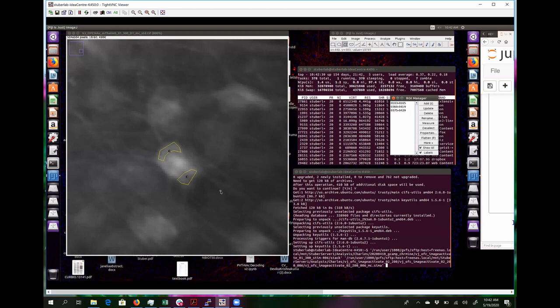ROI2, it's actually pretty clear to me where the cell is, but cell 3, it's hard to see where it is. There's some element of getting used to this. I've looked at this so many times, and not just looking at this, but comparing it to a video, that I know the video is the true estimation of where the cell is. I've done that so many times that I'm now pretty good at picking it up. So I can pretty much tell that this cell is going to be like that.